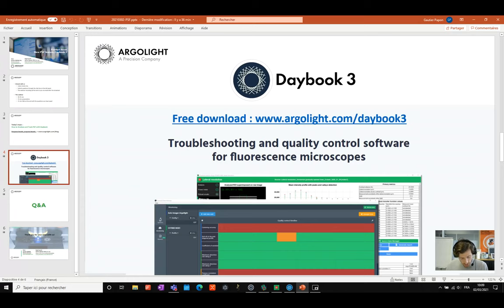The subject we have today is how to analyze and track PSF with Daybook. For those of you who don't know, Daybook 3 is a free download from our website. You have the link right here. It's a troubleshooting and quality control software for fluorescence microscopes. It's the third version. We've been developing this software for the past 5 years now. It's really designed to perform troubleshooting and quality control for fluorescence microscopes, and that's why we made some decisions regarding how we process, store, and display the results in our software. So let's start the software and see the new PSF feature.